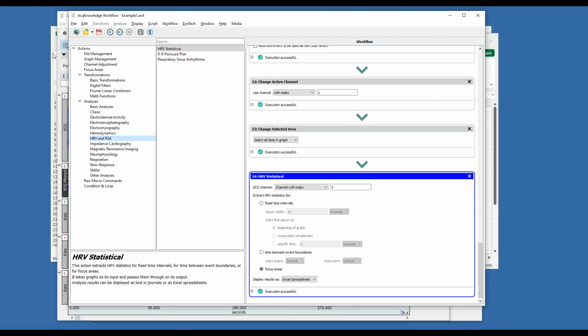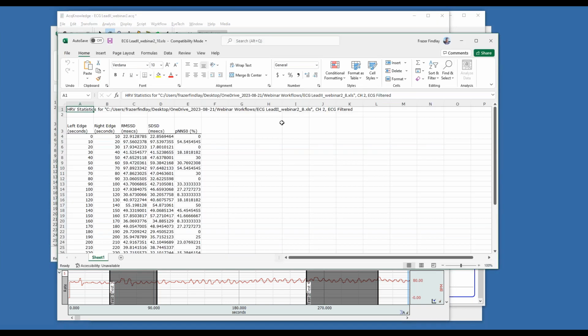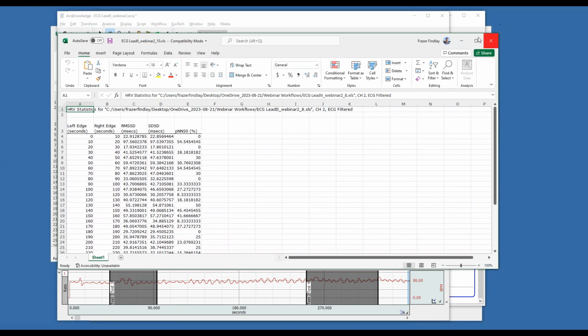All right, so I come back over here. It's performed my analysis and spat my results out. Actually, this was the previous one where I did everything, I think.